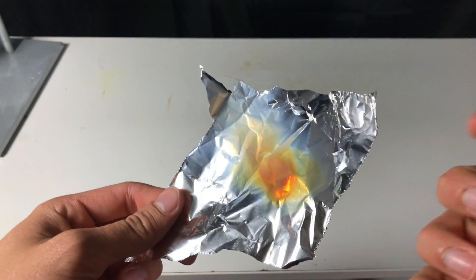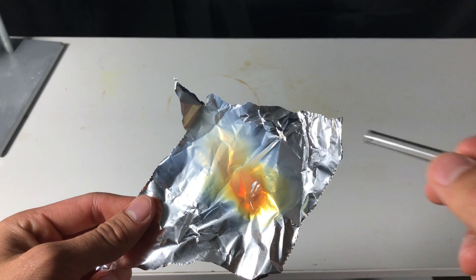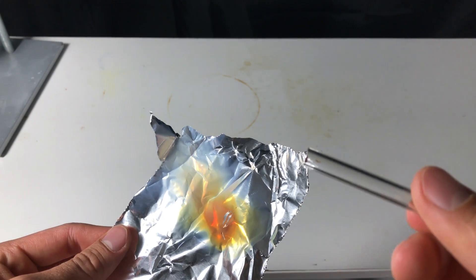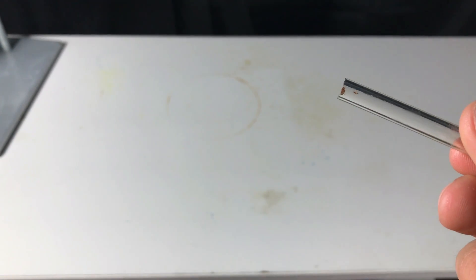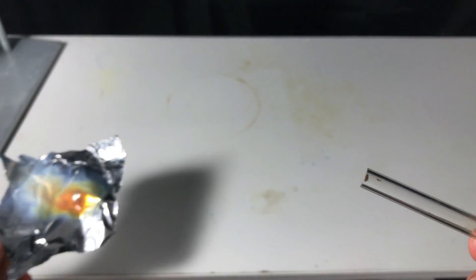On the aluminum foil, you can see a really fine layer of silicon dioxide, which you can easily scrape off.